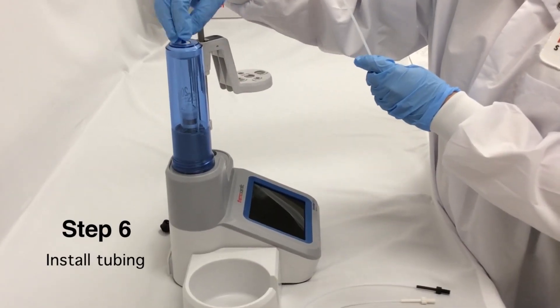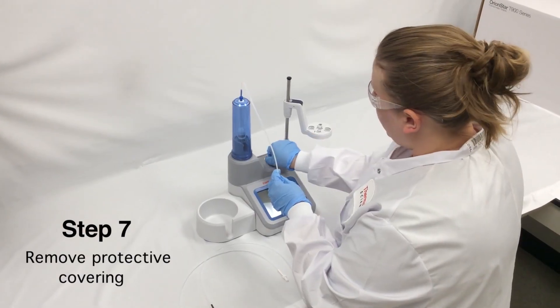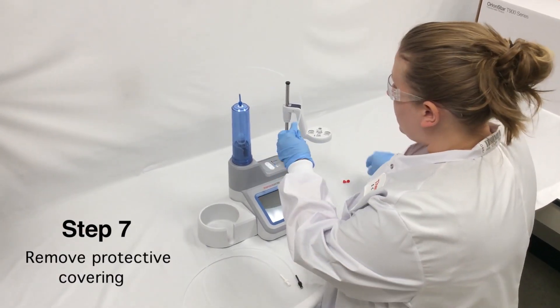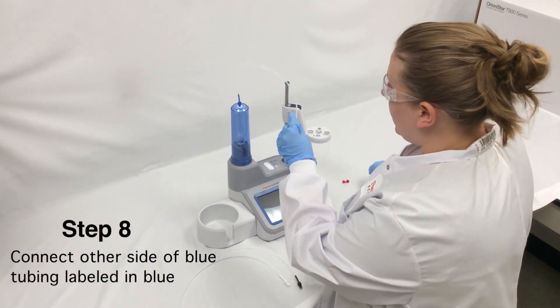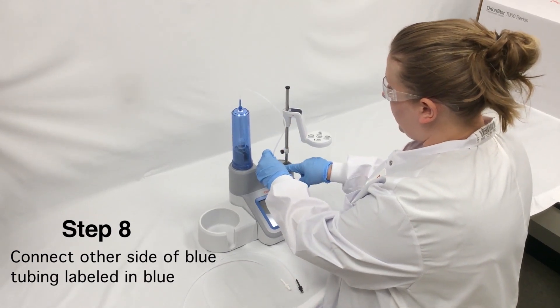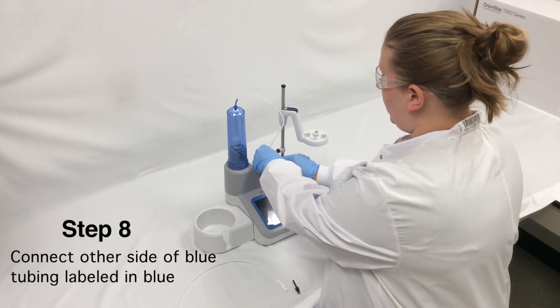Install the tubing by removing the protective covers that prevent dust from getting into the valve. Connect the other side of the blue tubing to the burette labeled in blue.